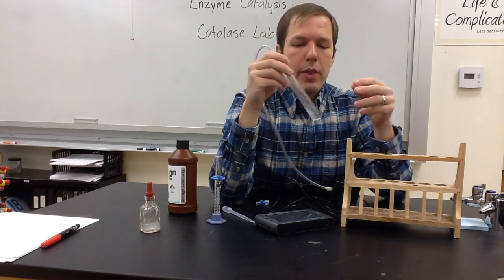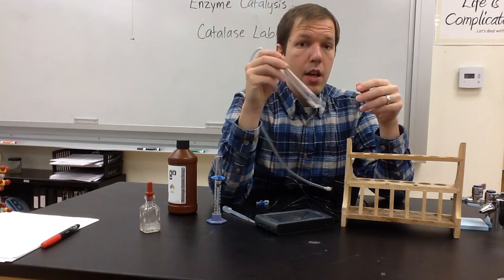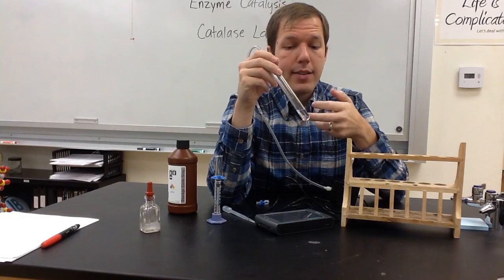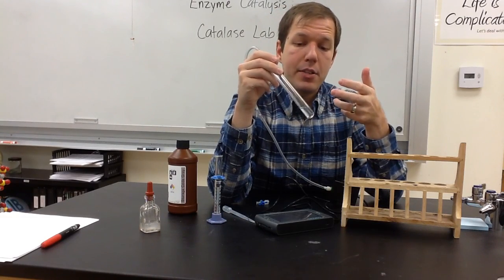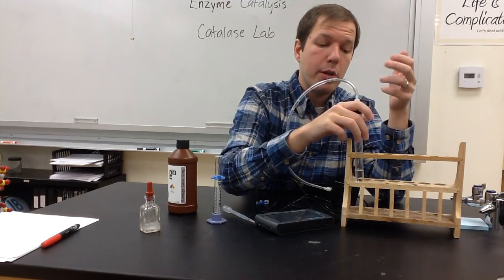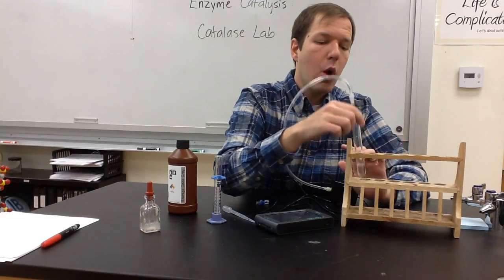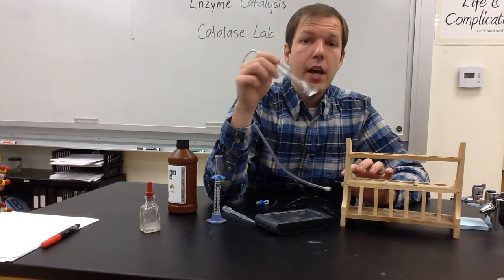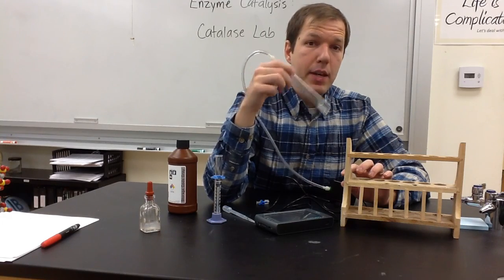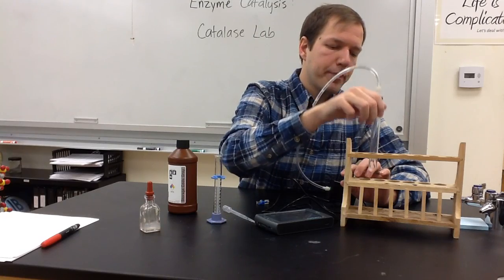As it's going, remember that stirring does impact the decomposition because an enzyme needs to come in contact with the peroxide in order to do its job and catalyze the reaction. So you need to be consistent in terms of whether these are going to remain motionless and you're going to let it sit here, or if you're going to do any stirring, and if you're going to do any stirring, for how long will you stir it. Be consistent with that because the more you stir, the greater the increase in pressure you should see.